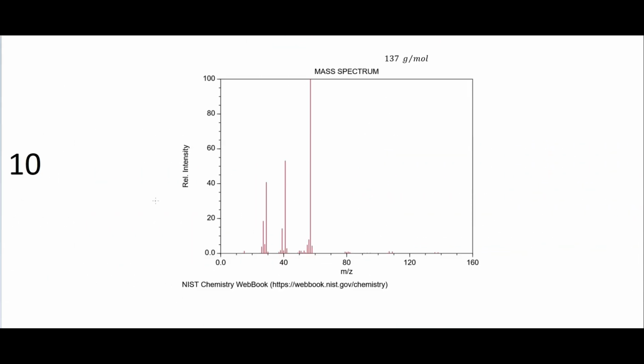And if we go down to this one, what we see is this is very similar to above. So we have the same molar mass here, and we have this right here. So those two peaks right there are about the same size.